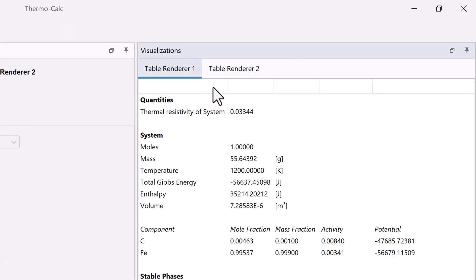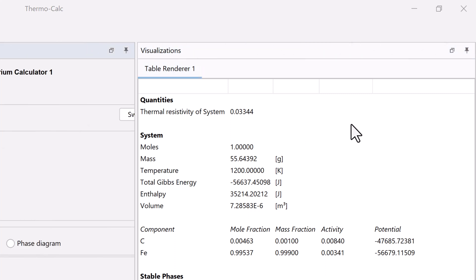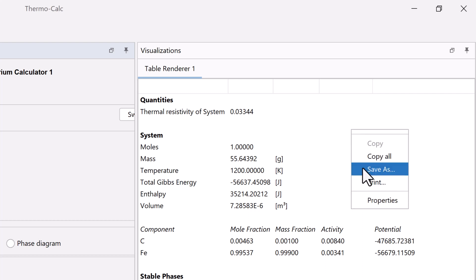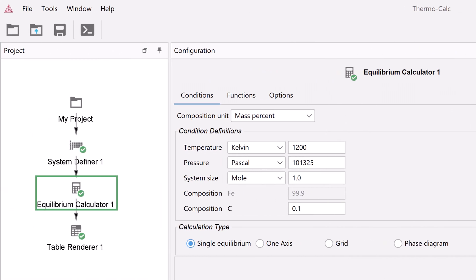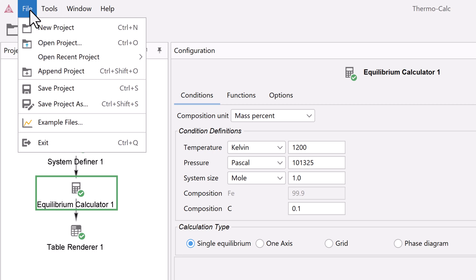You can export the contents of the table into a text file or spreadsheet by right-clicking anywhere on the table and selecting Save As. You can also save the entire project to return to it later or share it with others by clicking File, Save Project As.